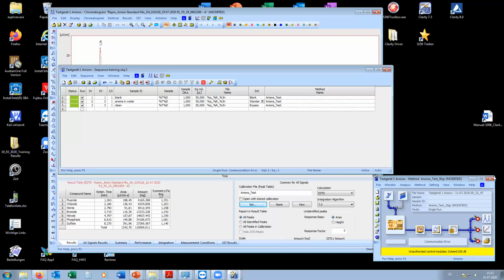But you also have a pre-column. You order the instrument or the column with the guard column, so the lifetime of your column will be even longer. I don't know. I don't want to say something stupid. If I would have to bet, I would say 2000 injections minimum.